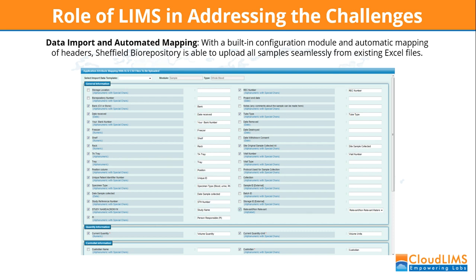We're also able to track things such as freeze-thaw for samples, visit numbers for each sample we log in, and integrate that into the data and produce a quality system with reliable information for the long term.